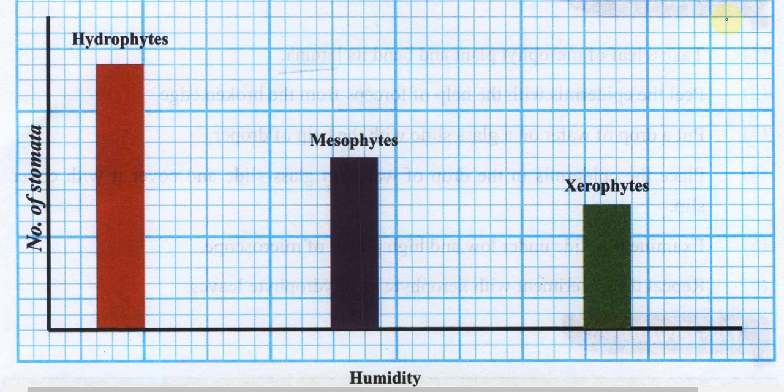You can also observe that the number of stomata increases with the increase in humidity and vice versa.